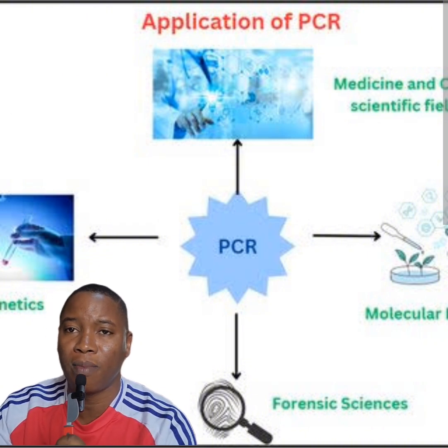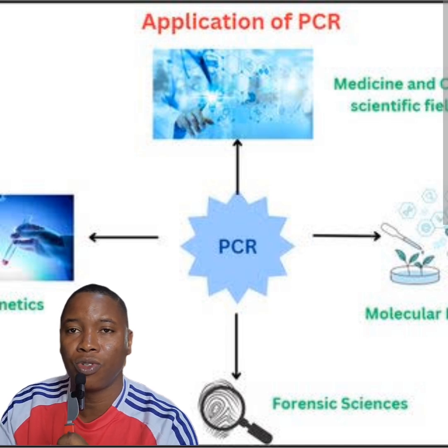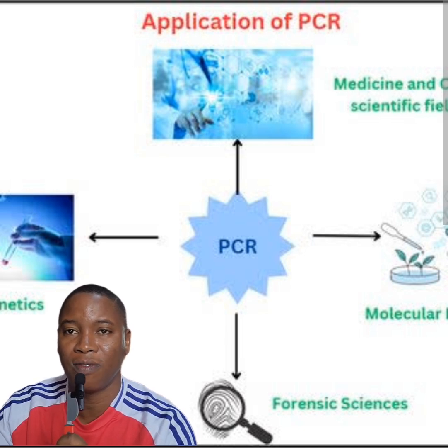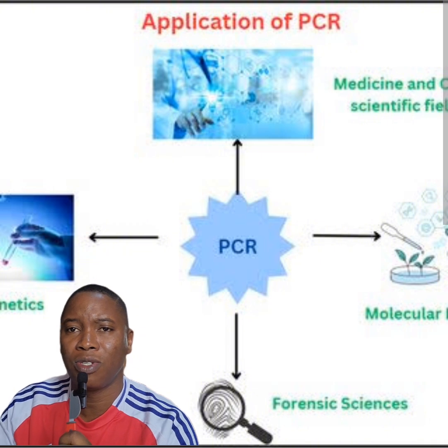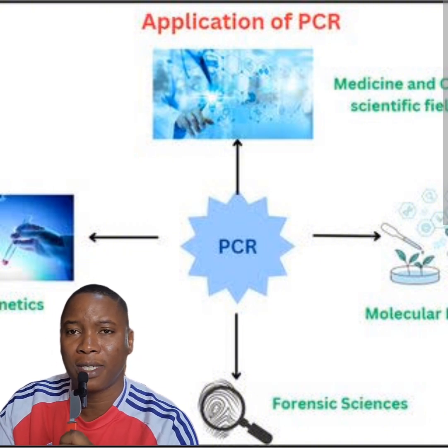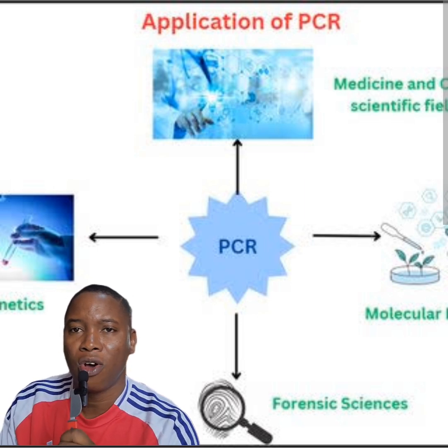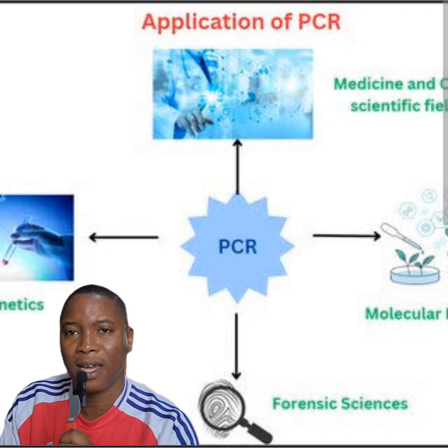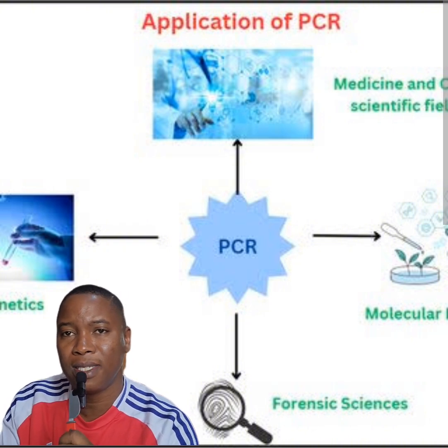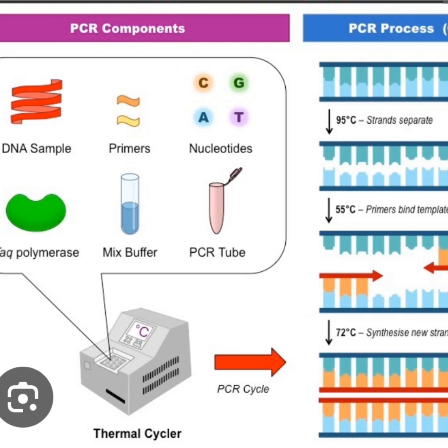Also, in the field of microbiology, just as we do in medical research, we also use PCR to identify different kinds of pathogens. Not only pathogens, we use it to identify different kinds of organisms. Organisms that have importance in environmental research, in agricultural research, in public health research. All of this we identify in microbiology using PCR and using our knowledge of PCR. This is really important.